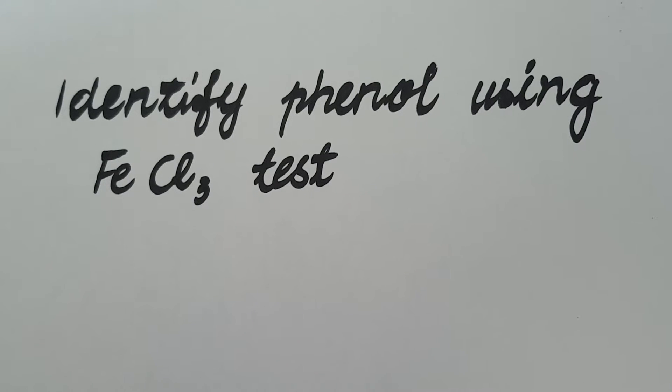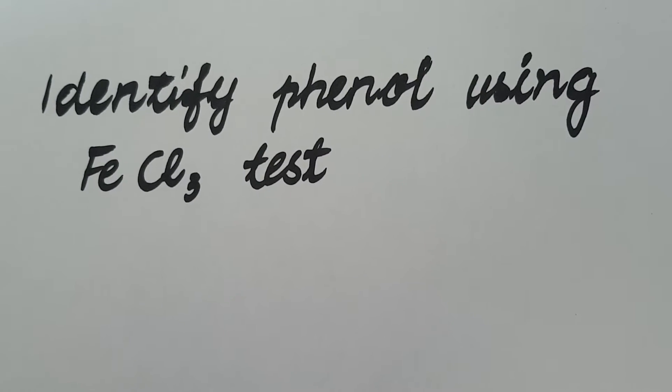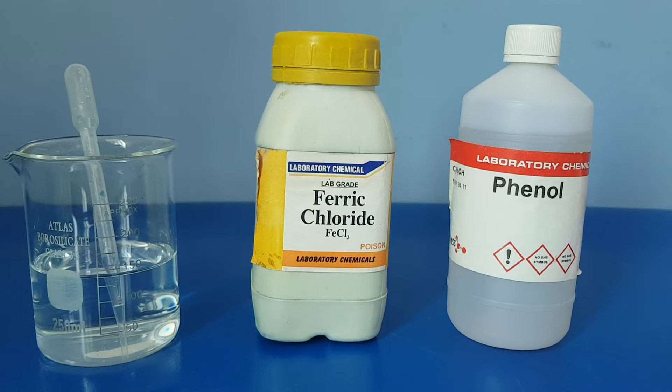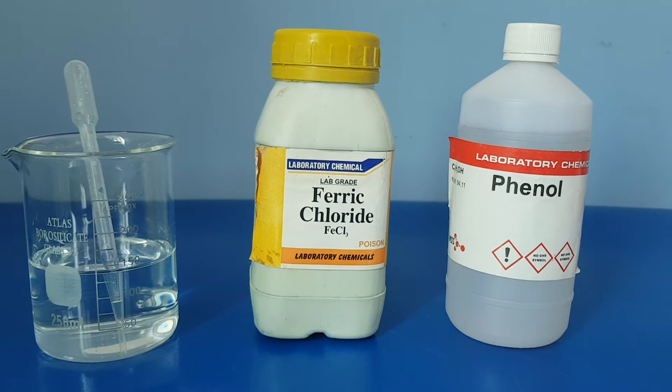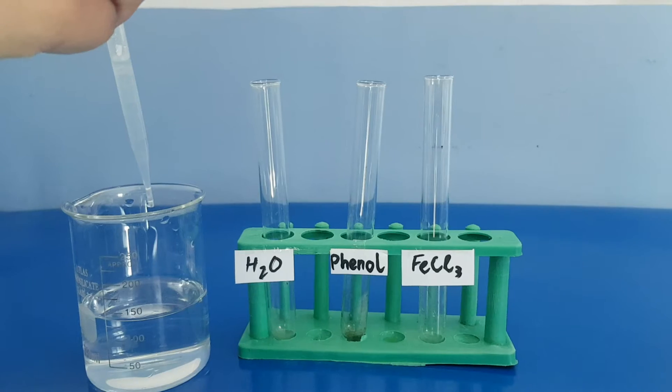Identify phenol using the ferric chloride test. For this experiment we need water, ferric chloride, and phenol.